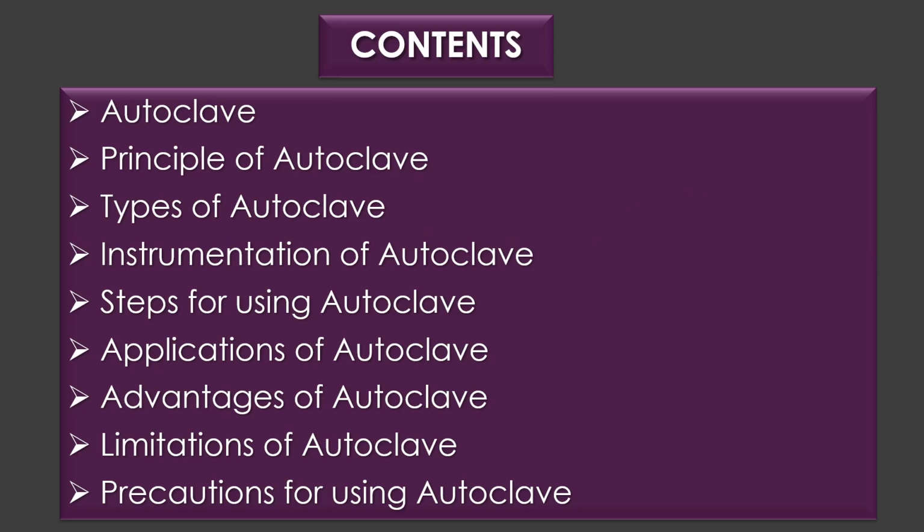The contents of this video include an introduction about autoclave, principle of autoclave, types of autoclave, instrumentation of autoclave, steps for using autoclave, applications of autoclave, advantages of autoclave, limitations of autoclave, precautions for using autoclave.